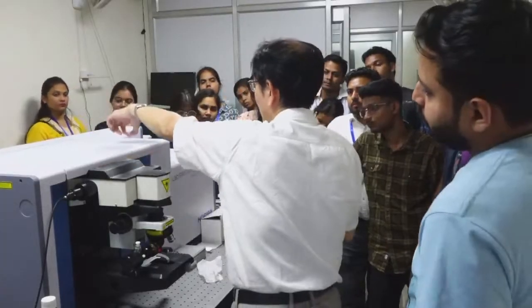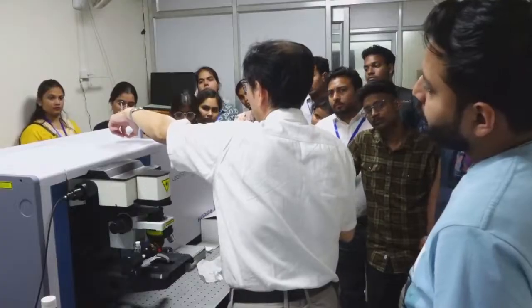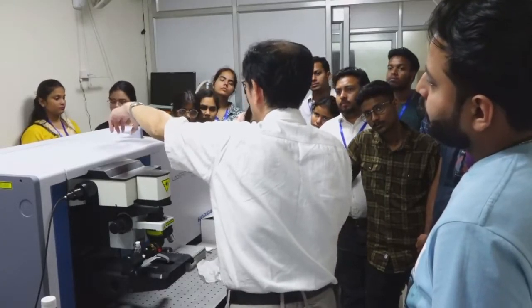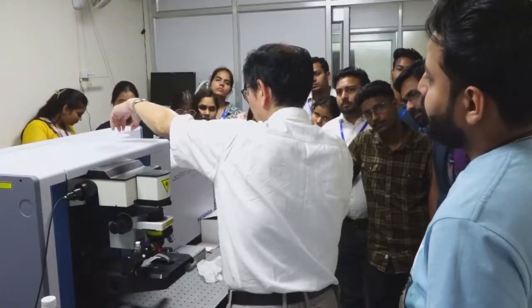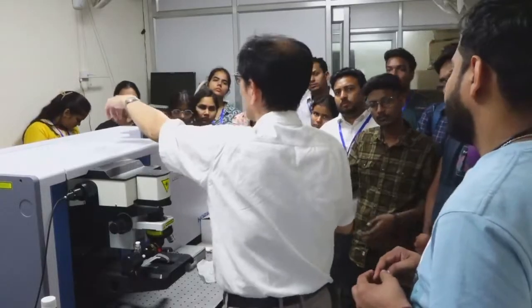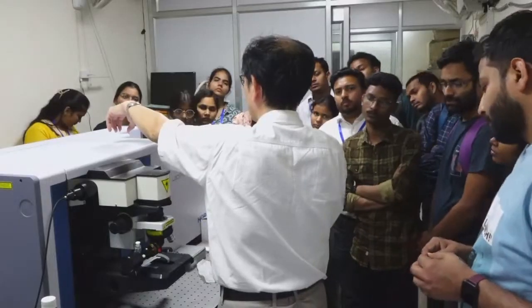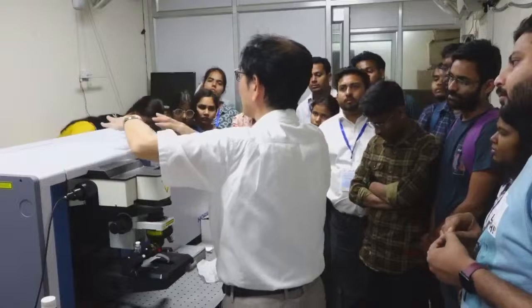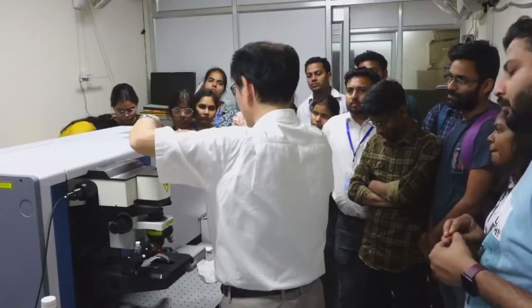I guess one more filter should be here, not a bandpass filter but a notch filter, to remove the excitation wavelengths to make the efficiency higher.